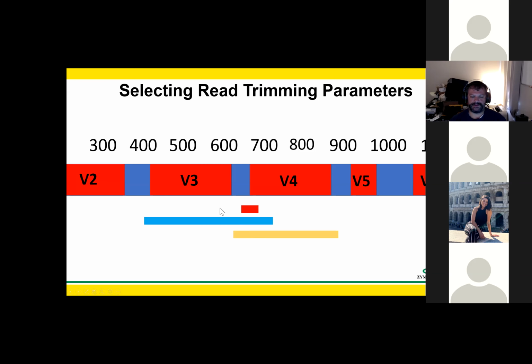And so we have these two overlapping reads. We have some area in the middle that we needed to overlap, and usually for overlap, you want to go for about 20 bases. I think you need a minimum of 10, so 20 gives you a good margin of safety. And one thing you can see here is that the overlaps are actually more than you need. So a lot of times you'll have an overlap range of about 60, which means you can move this actual overlap region around a little bit.